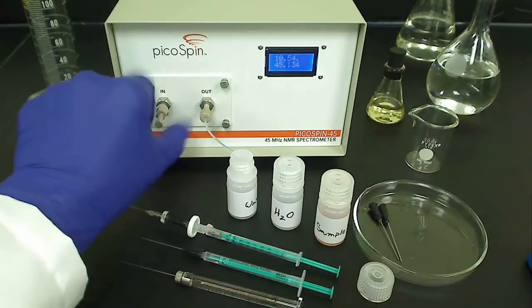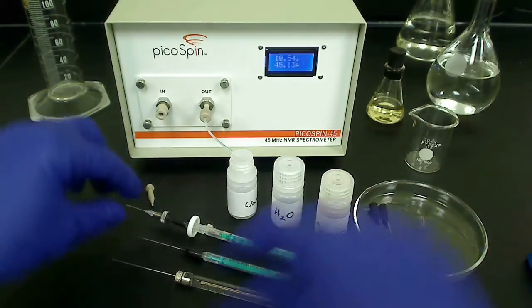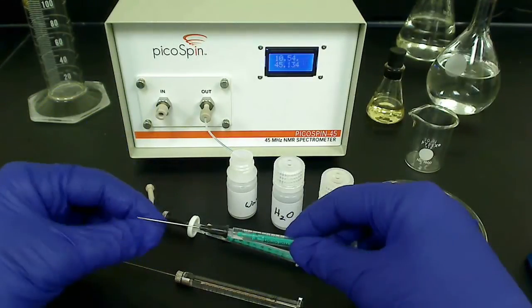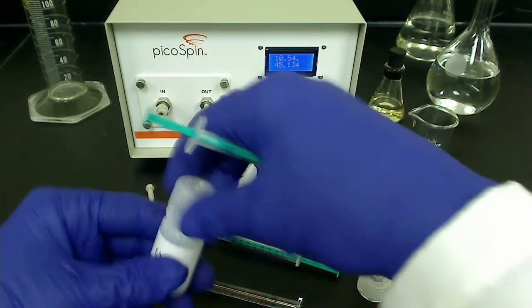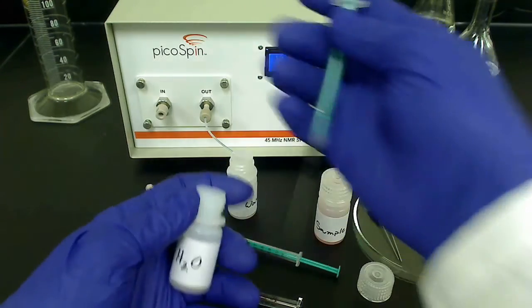When finished with the experiments for the day, we want to clean the cartridge by purging the last sample with an appropriate solvent, and finally with water, so that in the morning the unit is ready for shimming.